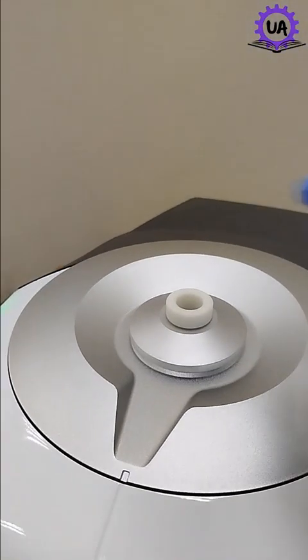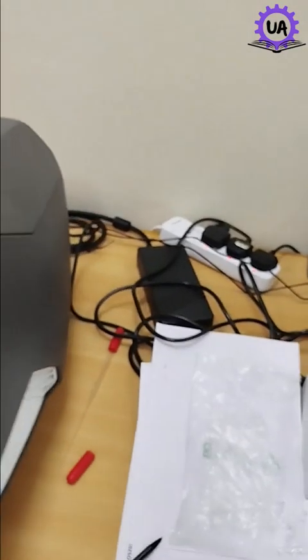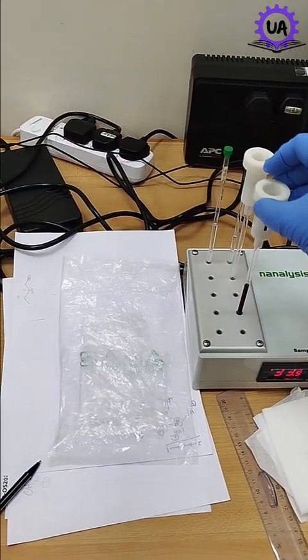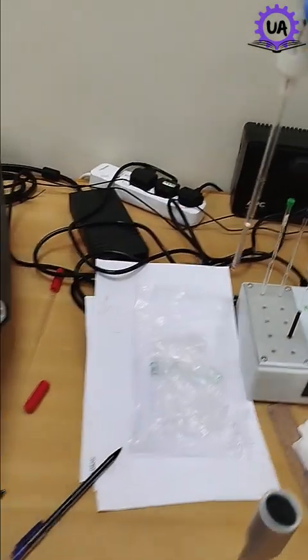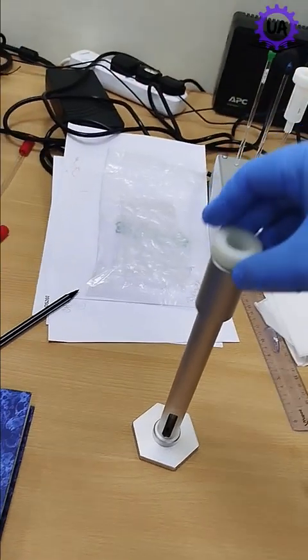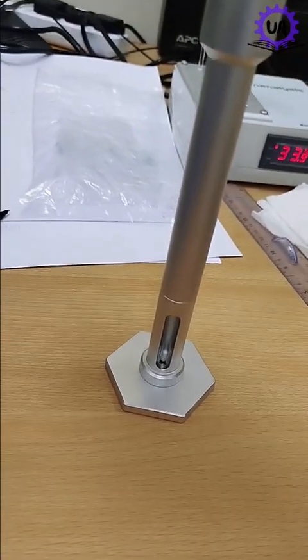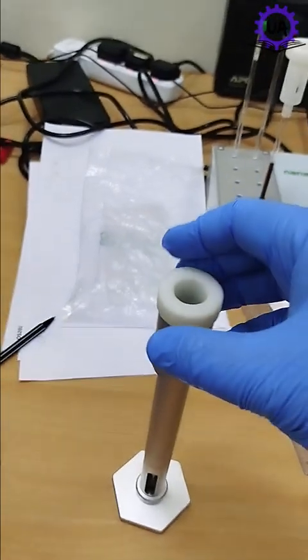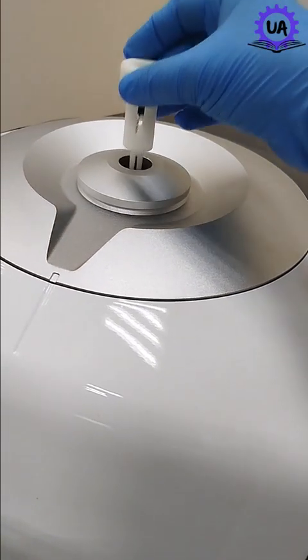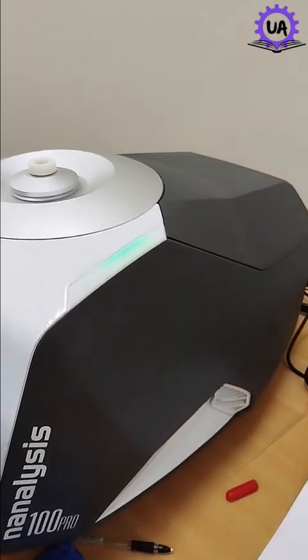Okay, after completion of your sample, you just need to take this NMR tube of your sample out and place it on the mantle, and then check the position of the tube again by that process. This is the reference tube. Okay, now it just touches the base, so it's okay. So I'll just take it out and place my reference tube in the NMR back. So that's all about NMR.